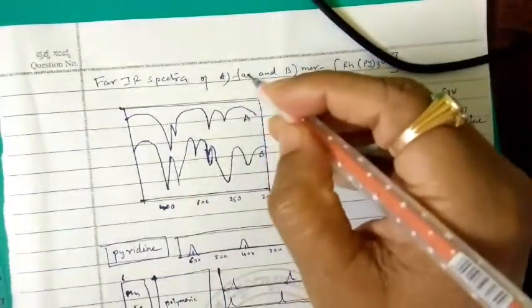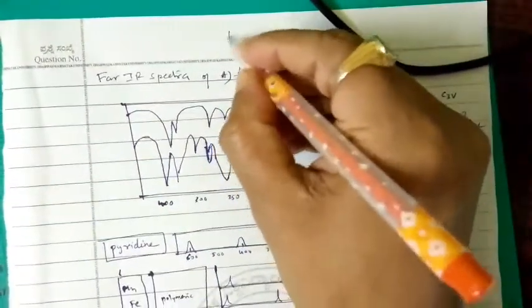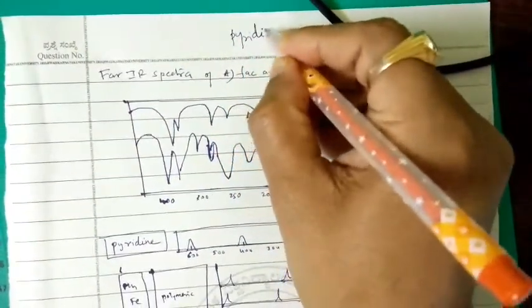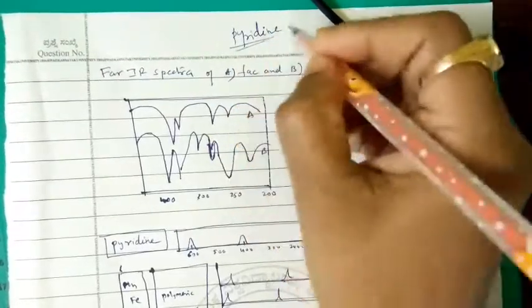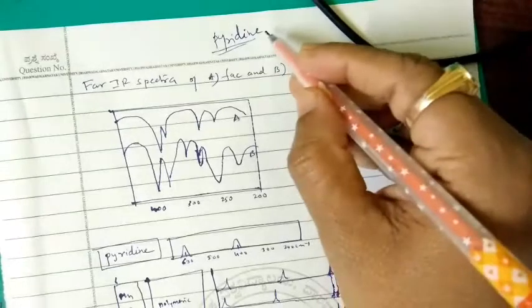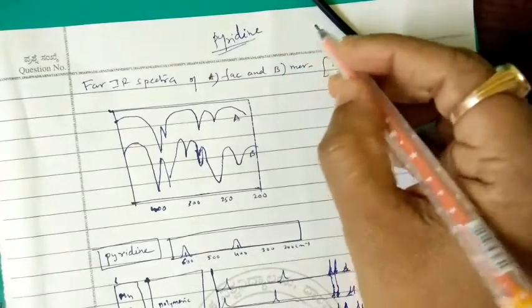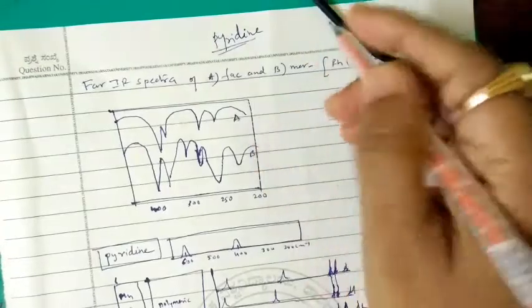Students, so today we'll go to the next IR complex frequency with respect to pyridine. On complex formation, the pyridine vibrations in the high frequency region can be seen not to be shifted appreciably.